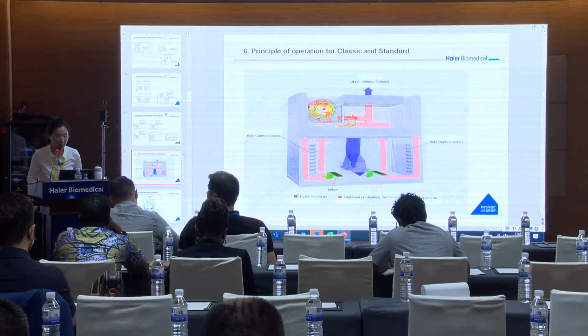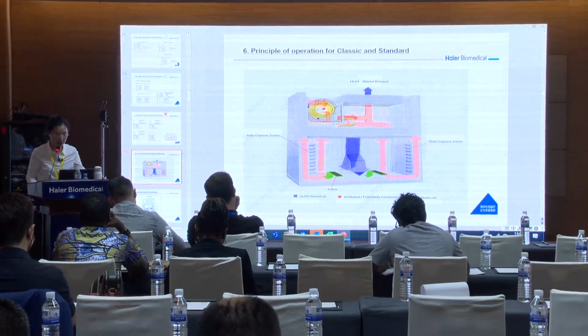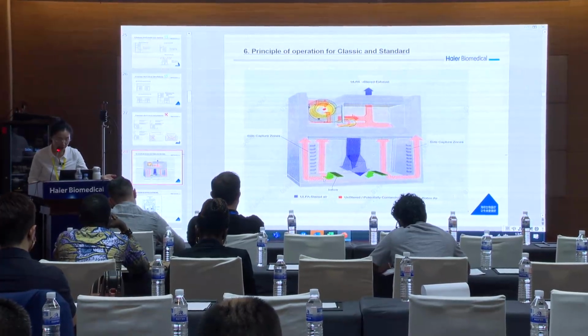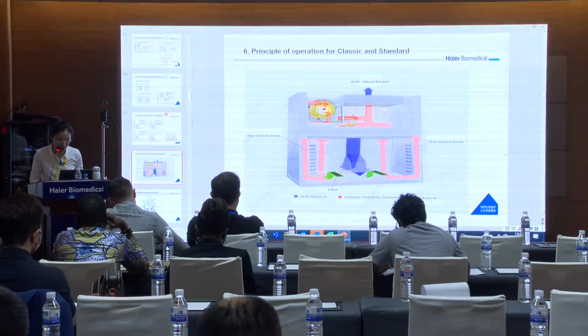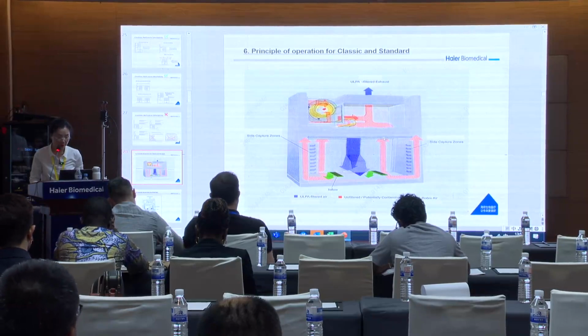And this is the principle of operation for the classic standard. We could see the room air, these are the green ones, inflow, and then it passes by this red. This red means unfiltered or potentially contaminated air.